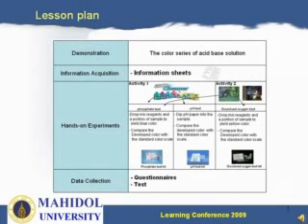For the lesson plan, I begin with an introduction, in which I talk about how important phosphate, detergents, and the environment are. I also provide a lesson plan for teachers and students. I divided the activities into 2 sections. Activity 1. Investigate detergents. Students investigate the amount of phosphate and pH in various detergents which are used in their daily life.